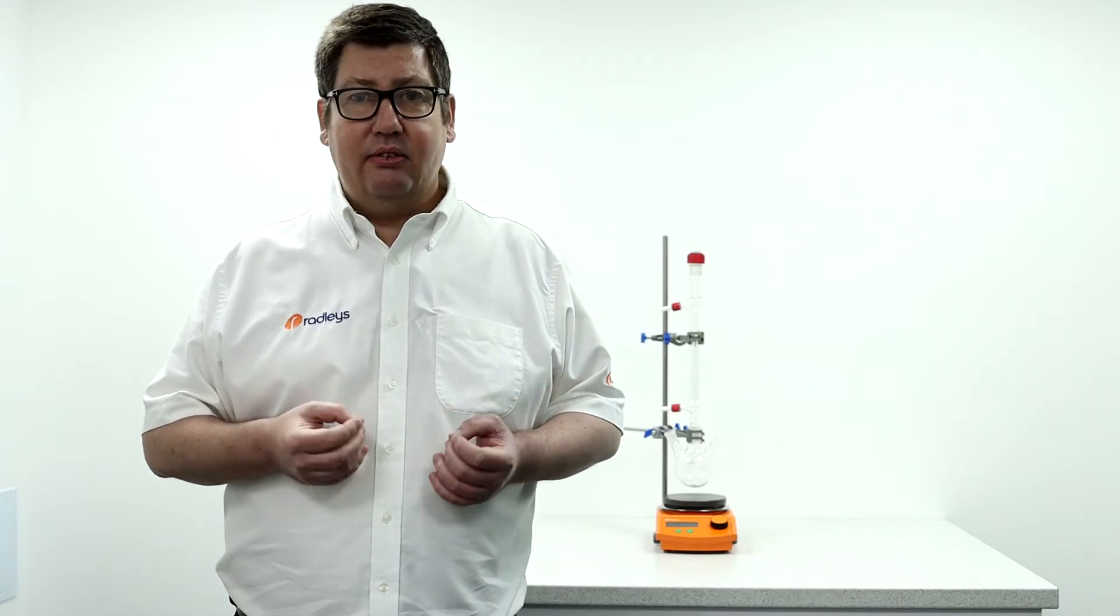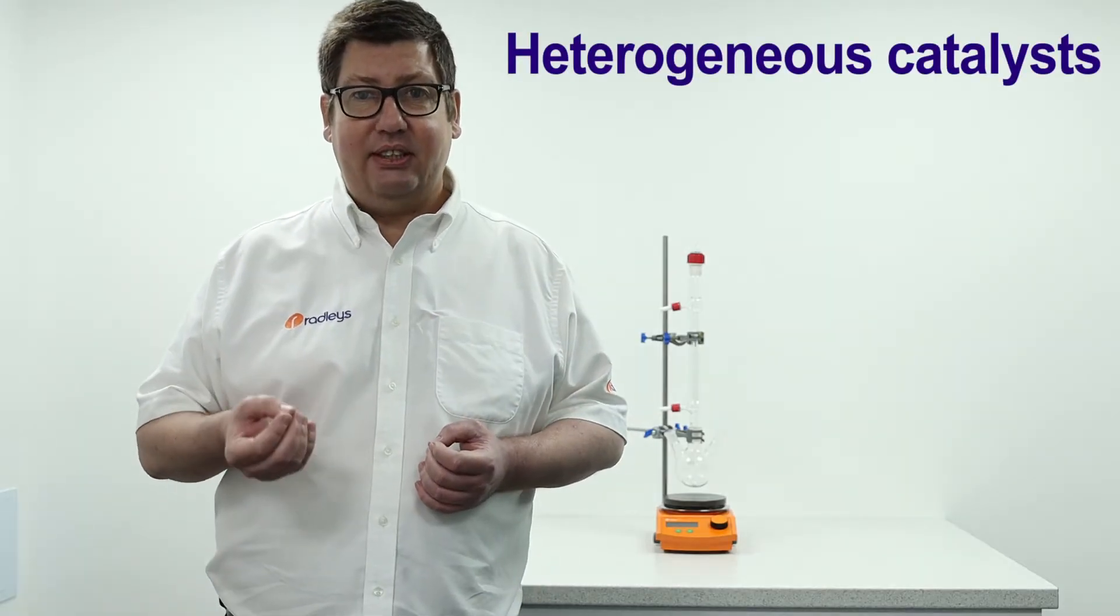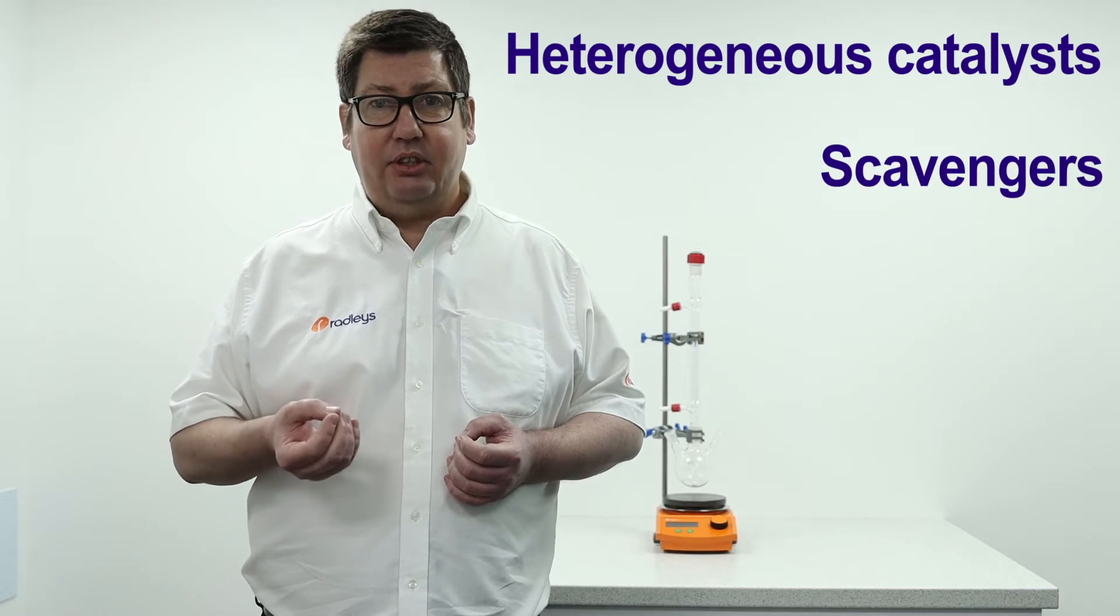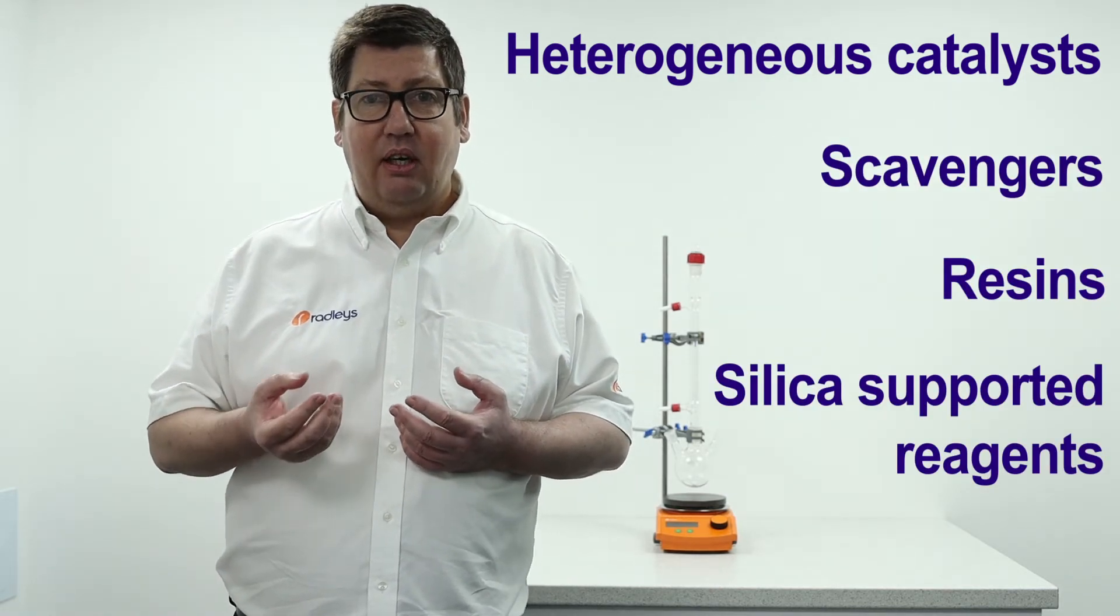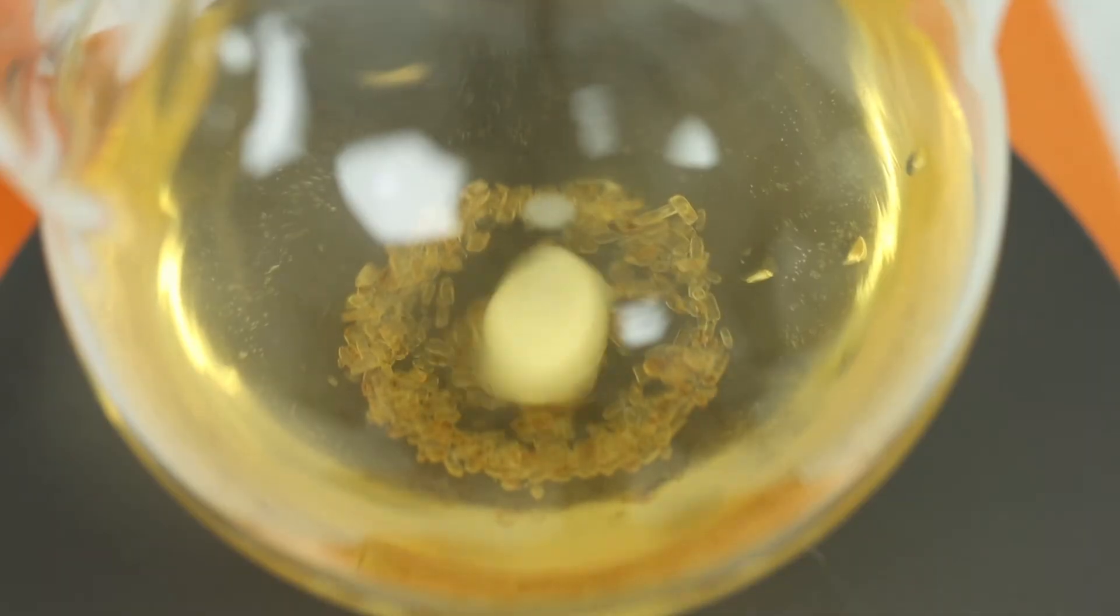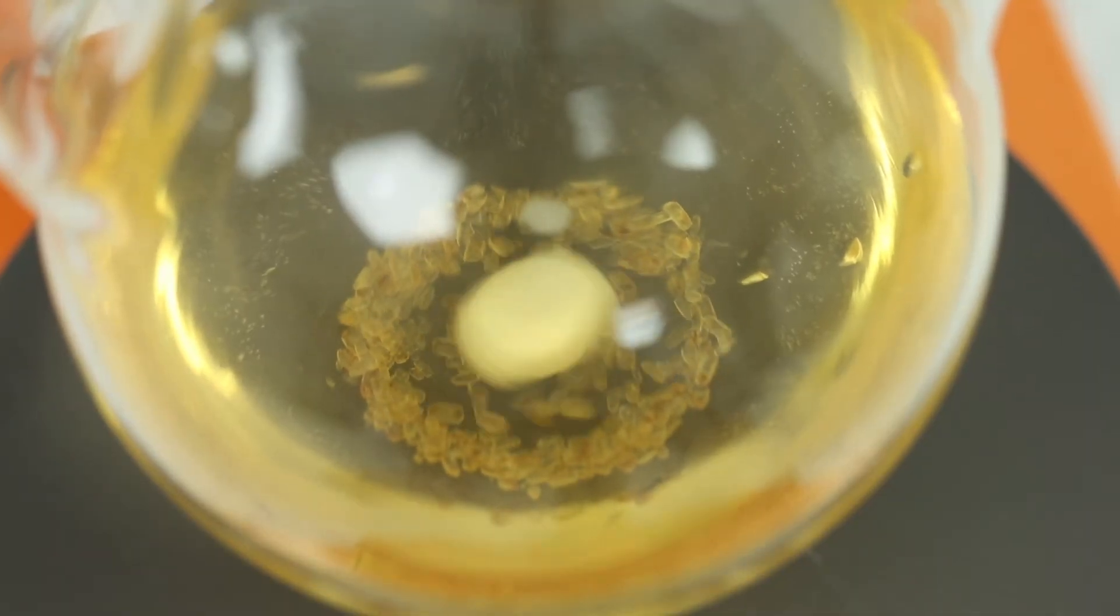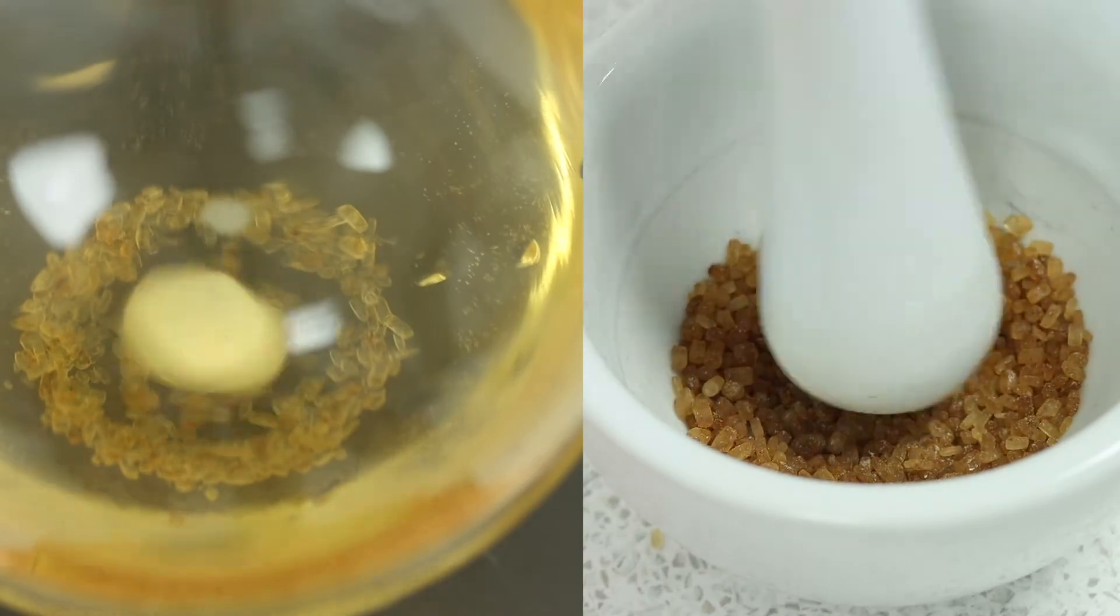Solids in the reactor, for example heterogeneous catalysis, the use of scavengers, resin or silica supported reagents are likely to be physically affected by the action of the stirrer bar having a grinding effect onto the particles, reducing particle size, increasing mass transfer and potentially giving different results to when we need to scale up to an overhead stirred system.